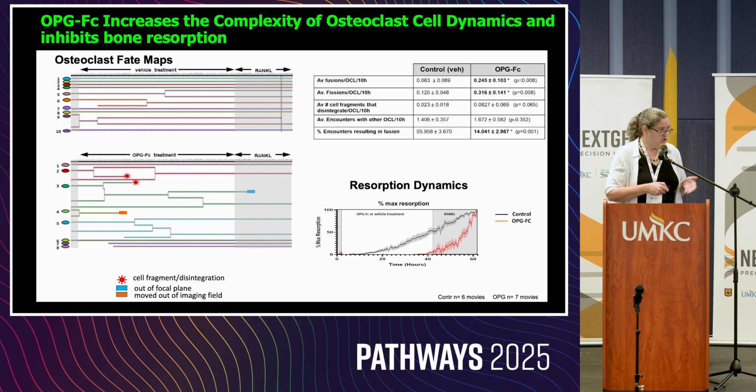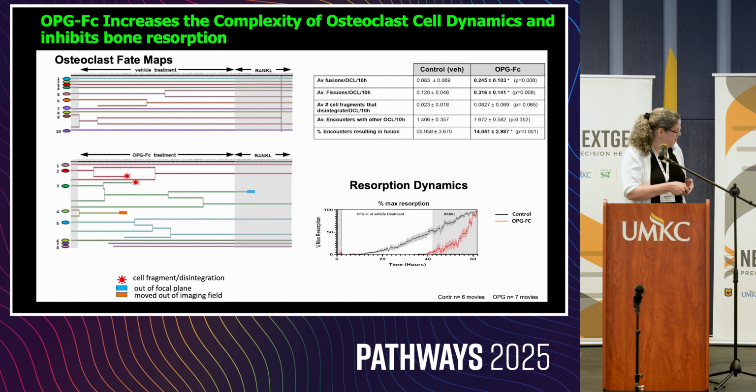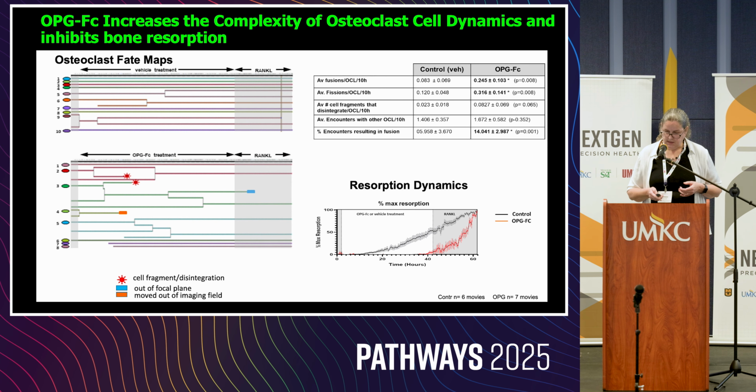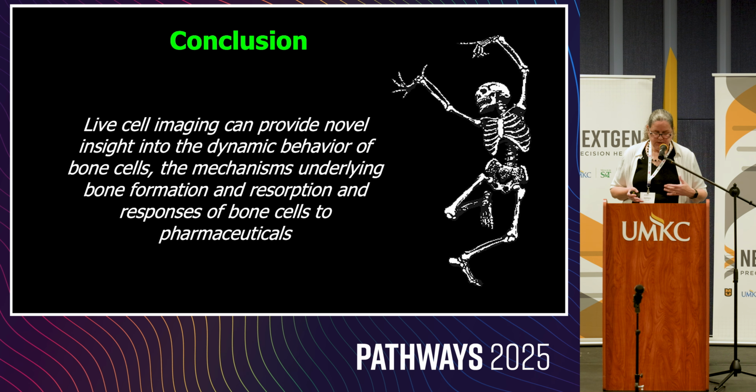I didn't get a chance to show you, but the data from the collagen resorption dynamics show that the OPG completely wipes out resorption, but then we can restart it when we add the RANK ligand at the end. So it's really just a flavor of some of the work we do.